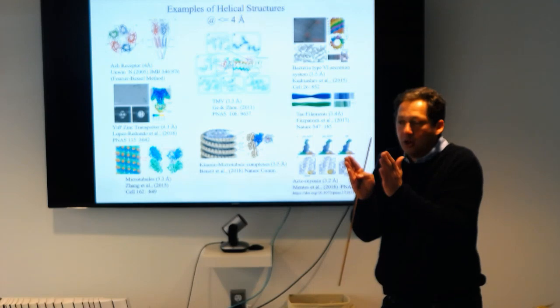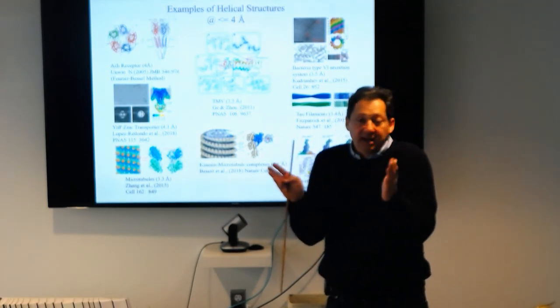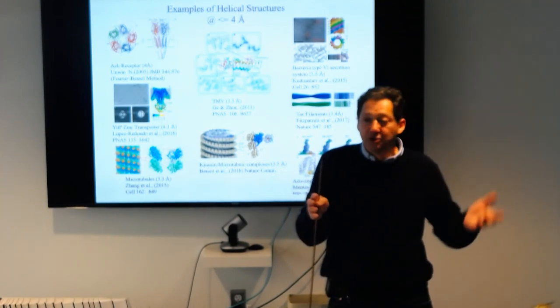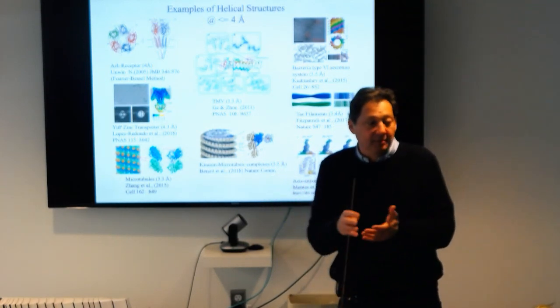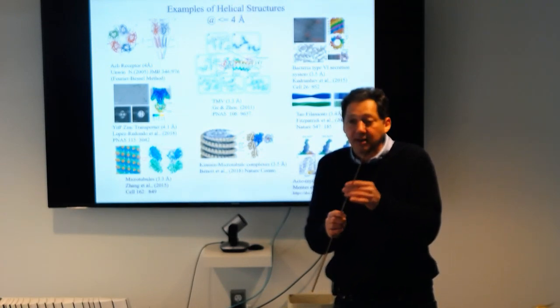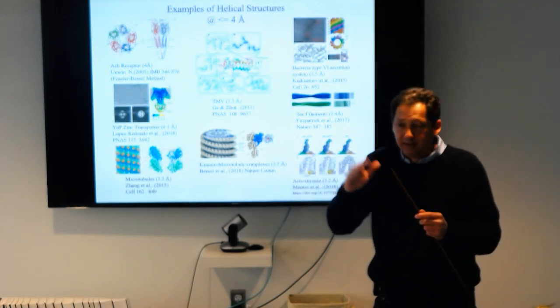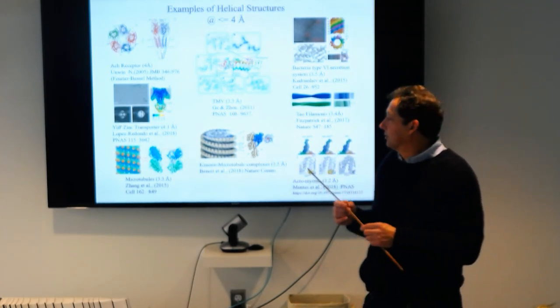When you are slicing your filament in single particle, if the filament diameter changes, you can just throw it out. You may have enough particles of the right diameter, or you can select for them, and you can correct for out-of-plane tilt quite easily, and this sort of thing.